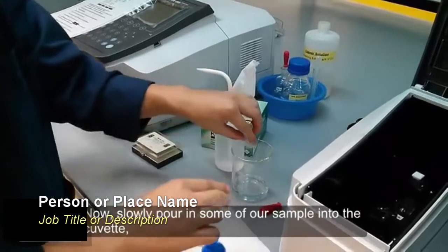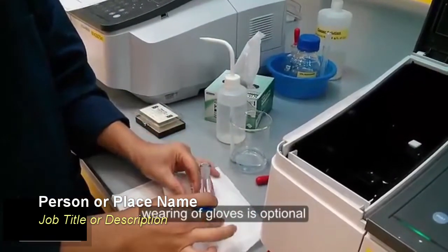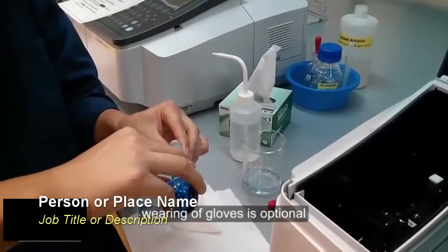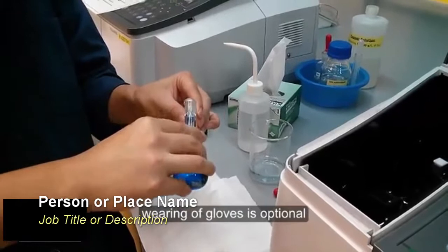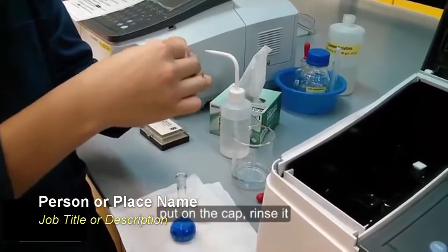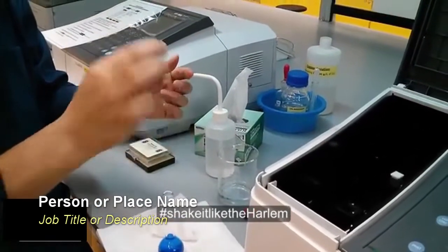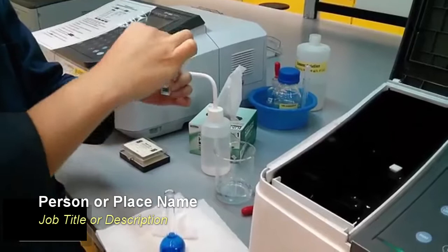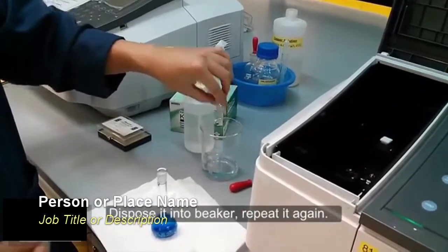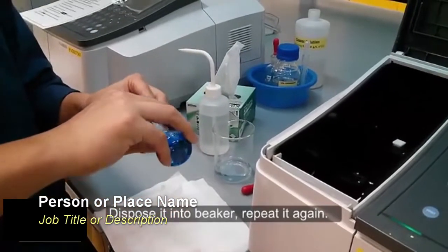Now slowly pour in some of our sample into the cuvette. Put on the cap, rinse it, and dispose of it into the beaker. Repeat this cycle again.